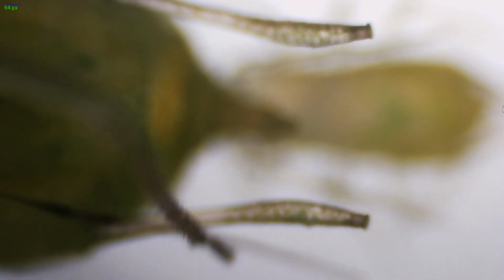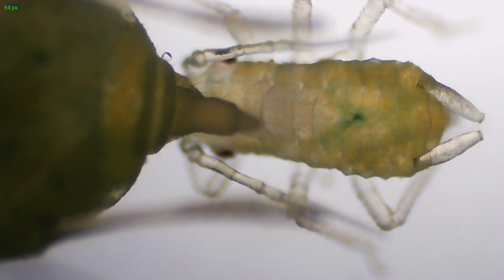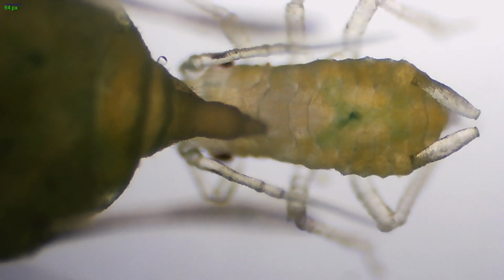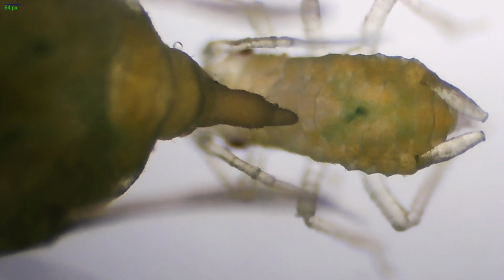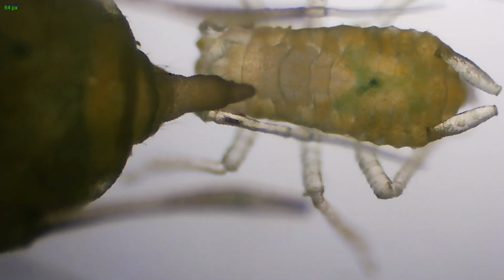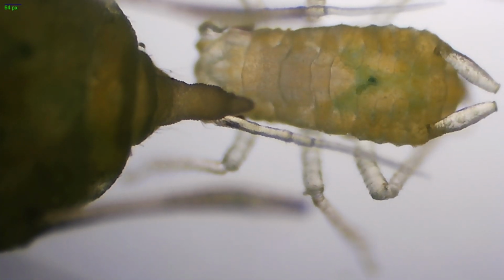Alright, so we are now under the microscope and we are looking at our aphids. And this aphid looks like it's having a baby. Either that aphid is sitting on that dude's face or it's having a baby. Anyway, that's interesting. Which brings me to a point, because aphids can actually reproduce asexually, meaning when they reproduce this way, they don't lay eggs, but rather they lay live offspring. So I don't know if that's what we just witnessed, but they can do that.